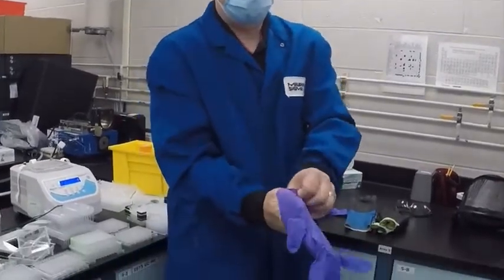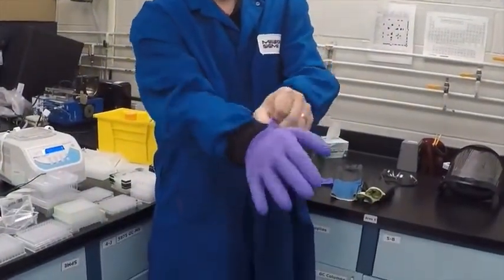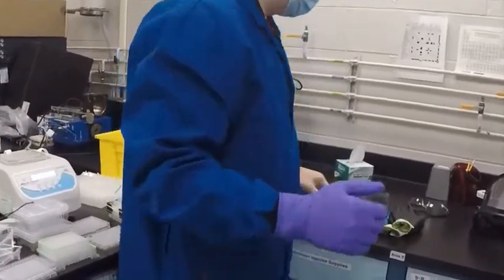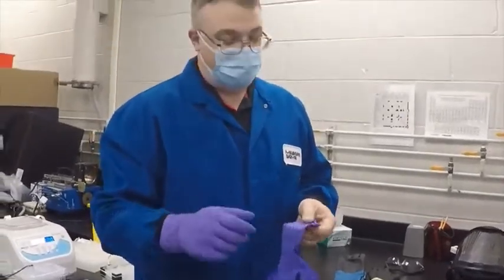Donning your gloves is pretty straightforward. You want to make sure the gloves fit you nice and snug. The better the fit of your gloves, the more dexterity you're going to have.